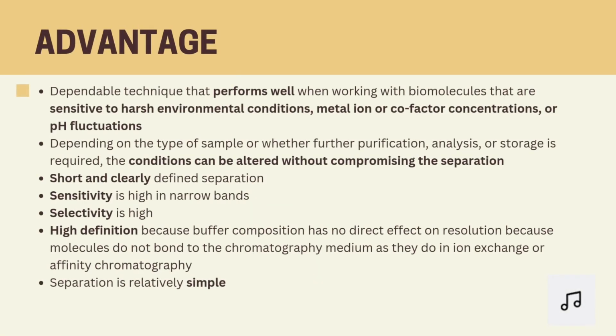First advantage: SEC is highly reliable for biomolecules, with low sensitivity to environmental changes like pH or metal ion fluctuation. It is fast and efficient and offers high sensitivity and selectivity for different molecule sizes. The process is simple, with excellent resolution, as buffer composition doesn't interfere, making it easy to use in the lab.